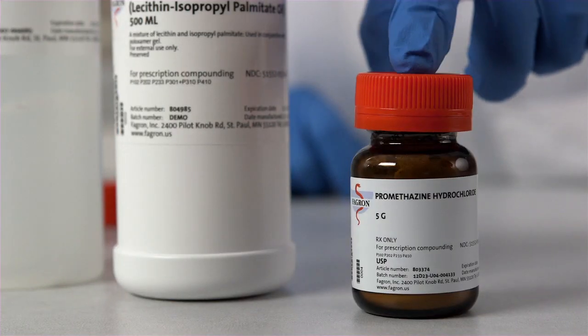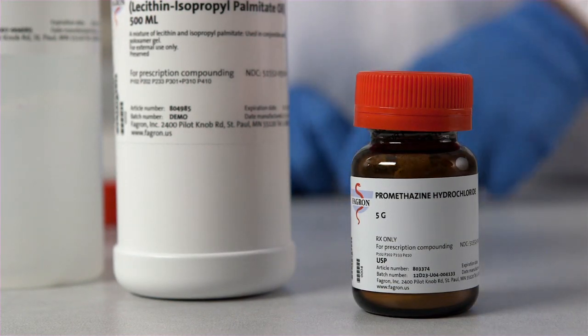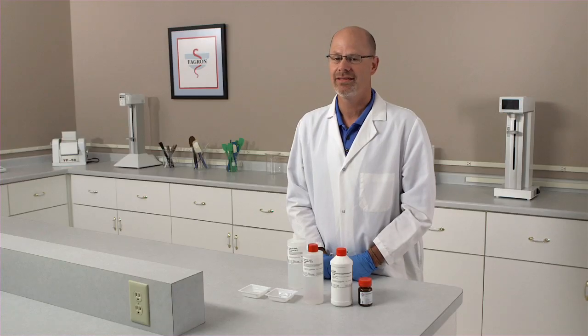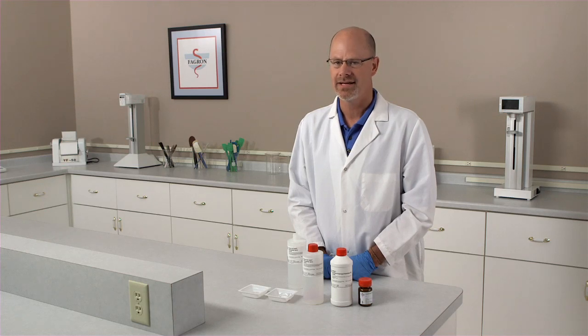The last ingredient will be our active. In this case, we're using promethazine hydrochloride. The first step is to calculate the quantity of ingredients needed in your formulation. Then you can begin the weighing process.